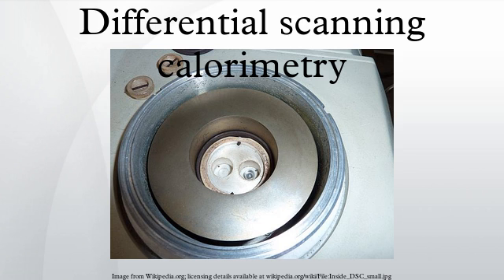General chemical analysis. Freezing point depression can be used as a purity analysis tool when analyzed by differential scanning calorimetry. This is possible because the temperature range over which a mixture of compounds melts is dependent on their relative amounts. Consequently, less pure compounds will exhibit a broadened melting peak that begins at lower temperature than a pure compound.